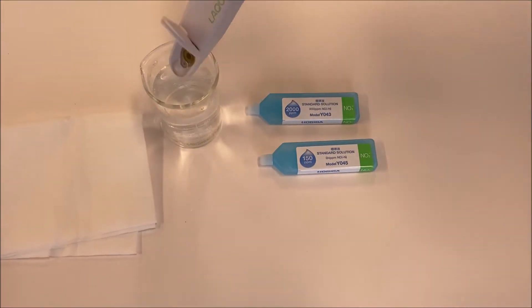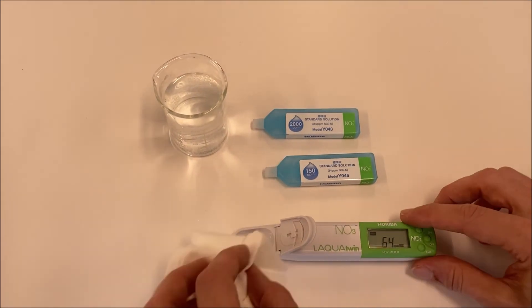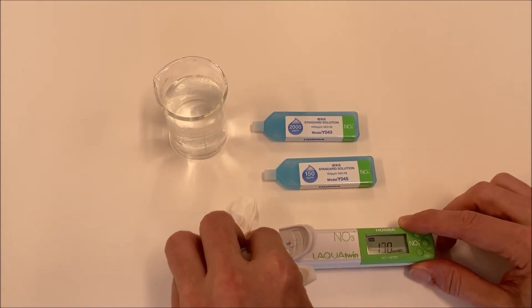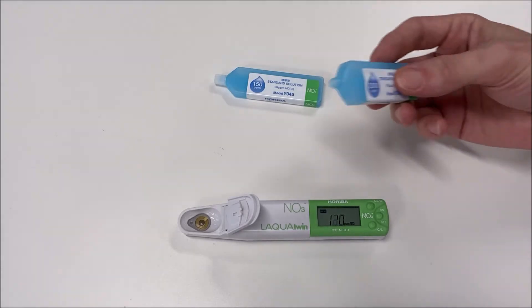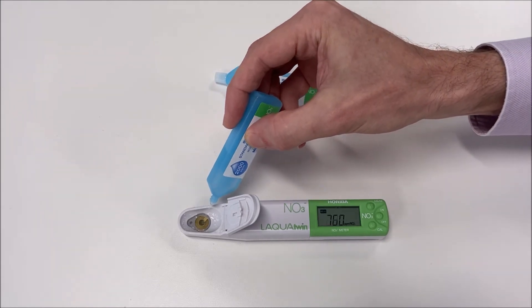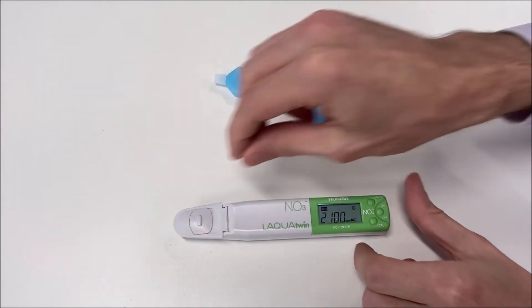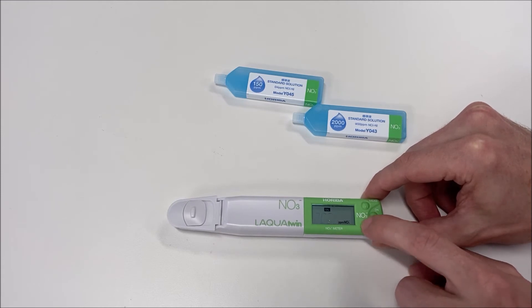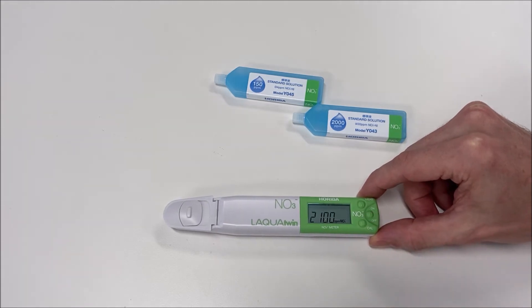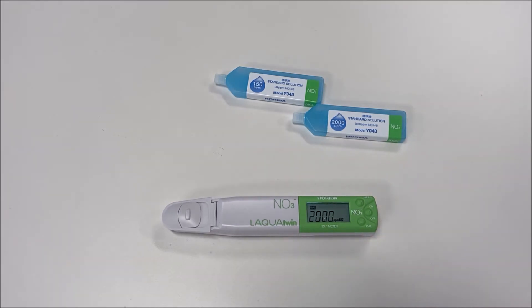Rinse the sensor with deionized water and dry it with a soft cloth, making sure that no micro drops remain on the sensor. Proceed with the second calibration point following the same procedure. Add the calibration solution and wait for 30 seconds. Press calibration to display the second point by default. Then press calibration one more time to confirm and start the calibration. The CAL icon and smiley face stop flashing when the calibration is completed.